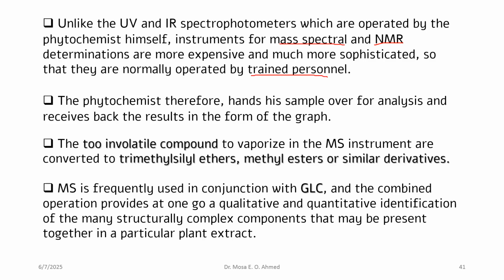While IR and UV spectrophotometers are less expensive and can be easily operated by the phytochemist himself.